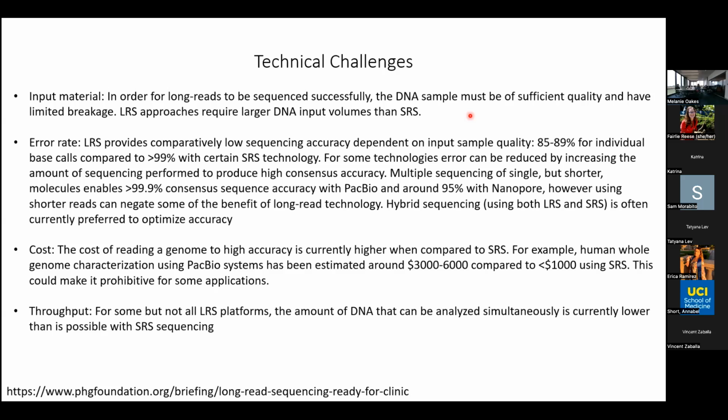A question: on the plus side, if the site is methylated, it means SMRT sequencing can detect methylation, kind of doing the same thing as bisulfite sequencing? Yes, but you're not having to do the bisulfite treatment, which tends to be really hard, on DNA. It's also worth noting that you couldn't do this with RNA, because RNA is also modified, but you have to convert it to cDNA for PacBio, so you lose the modifications for that. Yep, you do.